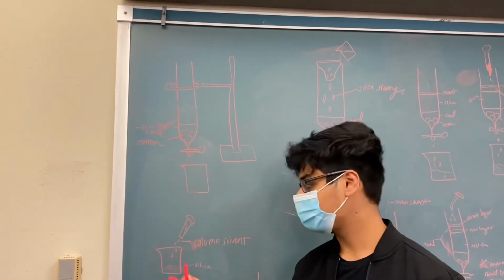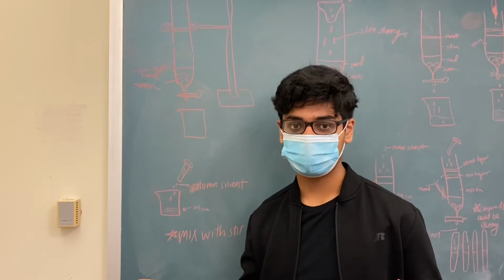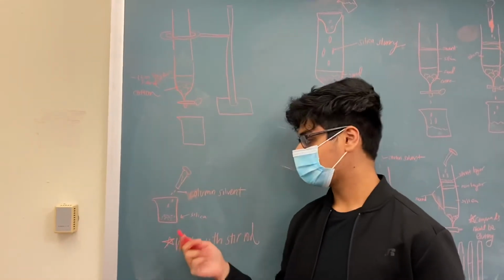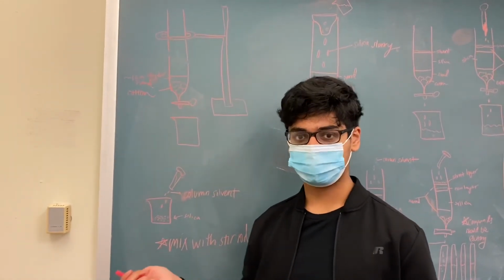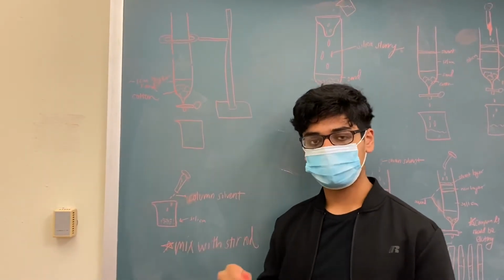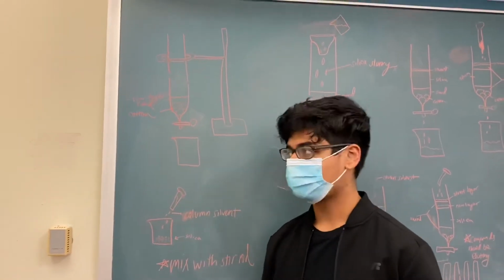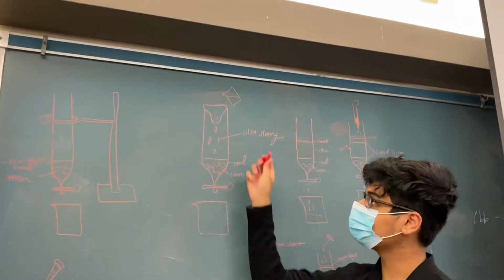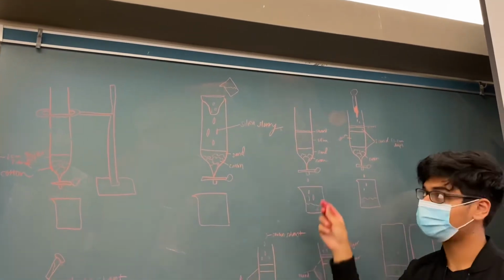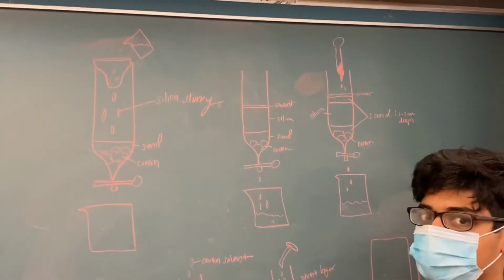Then off to the side, you're going to obtain a certain amount of silica. Make sure you do this whole thing under the hood, because there are severe health hazards when breathing silica. Once you obtain your required amount of silica and record the mass, you're going to put that into a beaker. Then you're going to add some column solvent and mix it up with the stirring rod, so you get a slurry consistency. Once you have that, you're going to put a funnel on top and pour the slurry down into the reaction column. You should see 2 layers forming, the silica and then a solvent layer, because this is like a slushy thing, so it's not perfectly mixed.